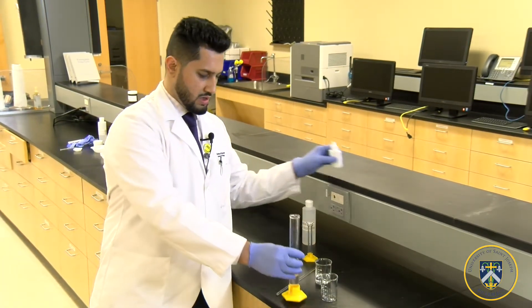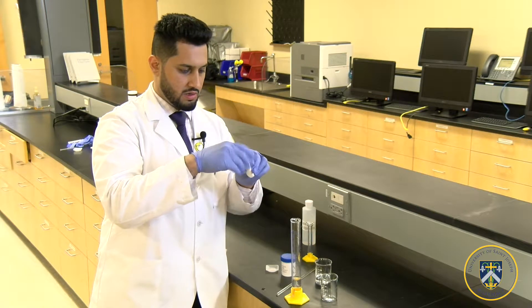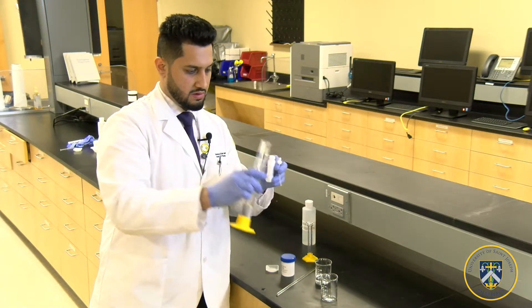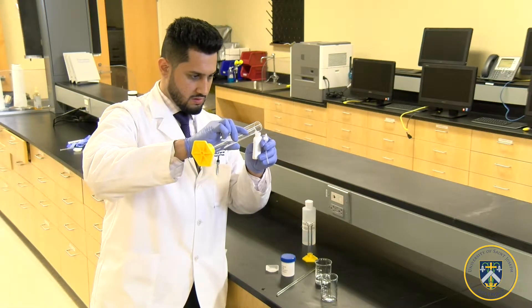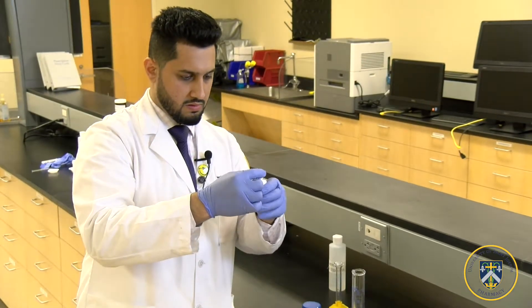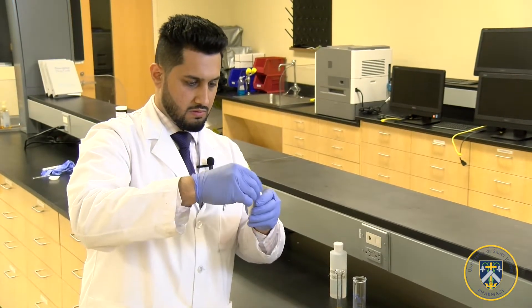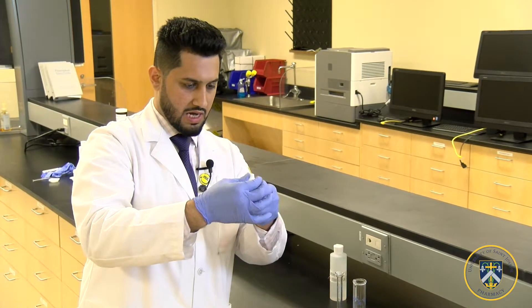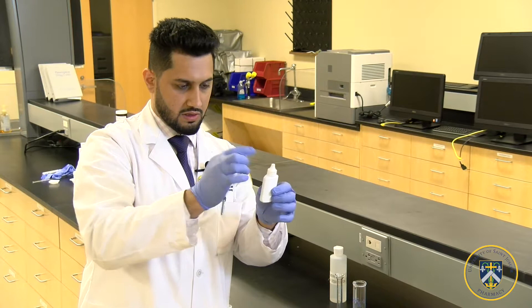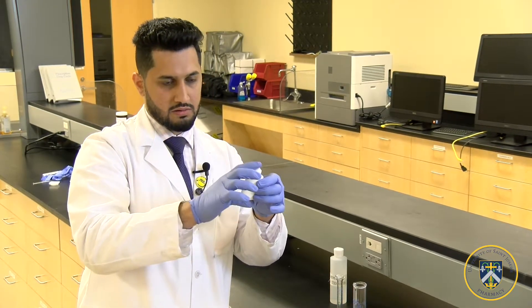Then we're going to pour it in our dropper that is specialized for nasal use. Make sure you close the cap tightly, because it fits the little dropper that's inside neatly.